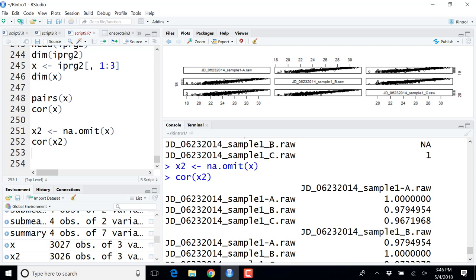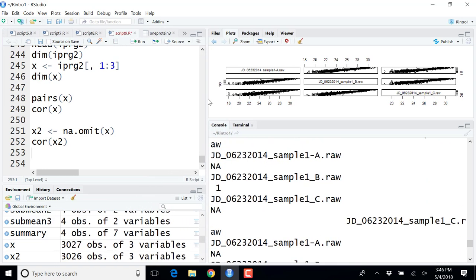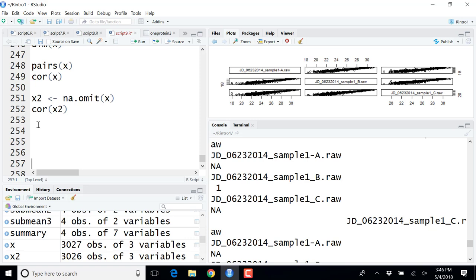Okay, and as I showed in one of the examples at the beginning of this section, correlation is really hard to say. It's really what we want to address. So for another way, we can show this type of correlation between the replicates. We can draw the MA plot.